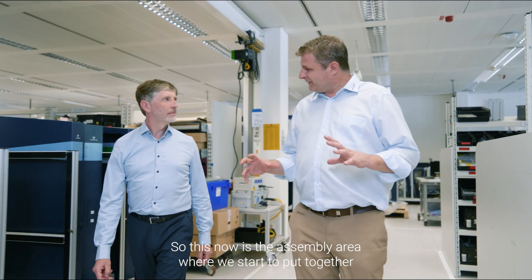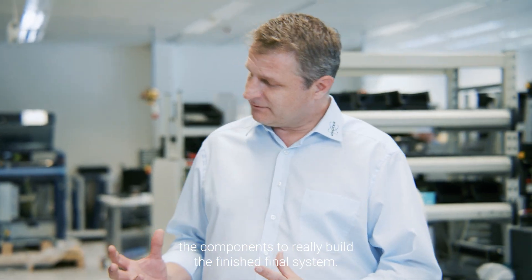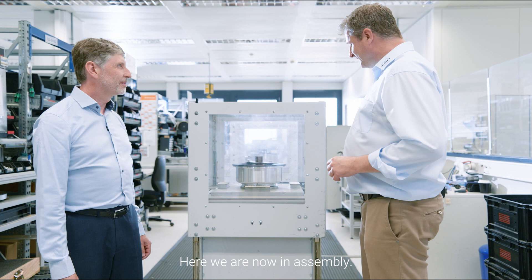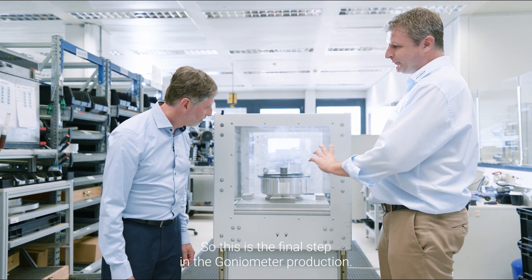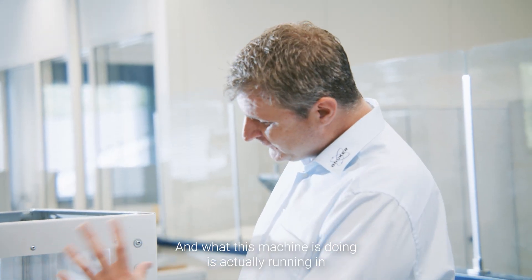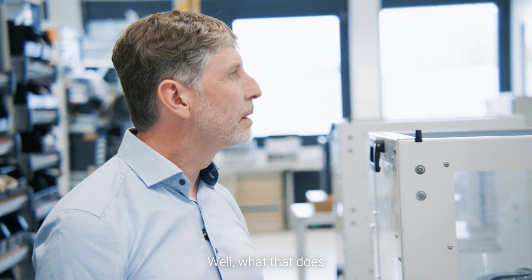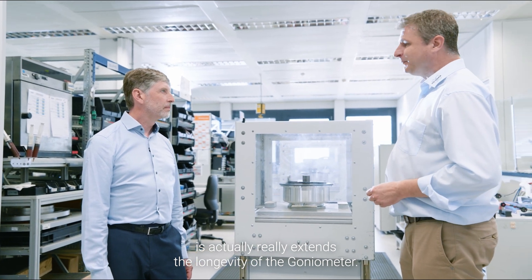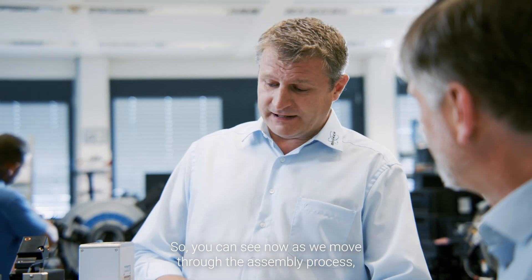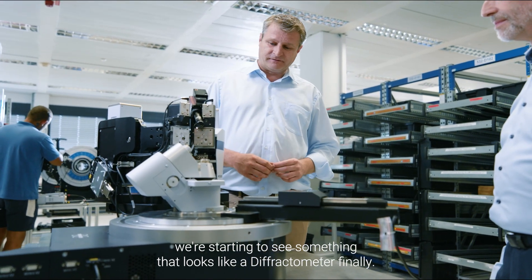This now is the assembly area where we start to put together the components to really build the finished final system. The first thing I wanted to show you is this machine here — this is the final step in the goniometer production, and what this machine is doing is actually running in the bearings on the goniometer. That really extends the longevity of the goniometer. As we move through the assembly process we're starting to see something that looks like a diffractometer finally.